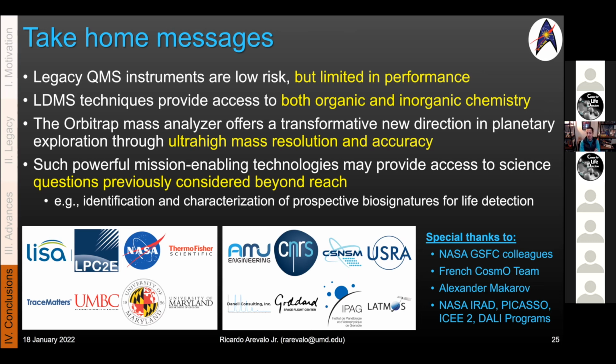So right now, I don't want to give an apples to apples comparison. I can say from a detection limit, we were trying to understand this too for our lunar proposal. So we looked at NIST 610. If you're a LIBS person, then maybe you're familiar with it. It's a standard reference material. Based on a very cursory test, we kind of threw it in our instrument on the last day that we could collect spectra for our proposal, and we were able to see rare earth elements down to 5 ppm levels.